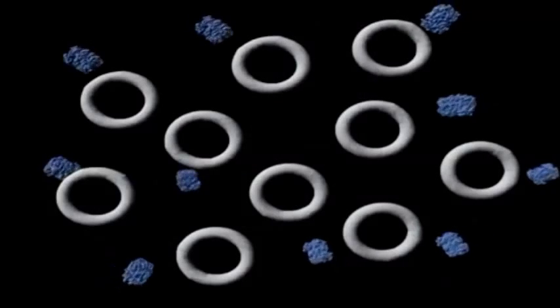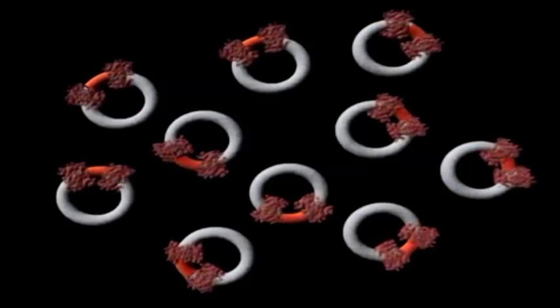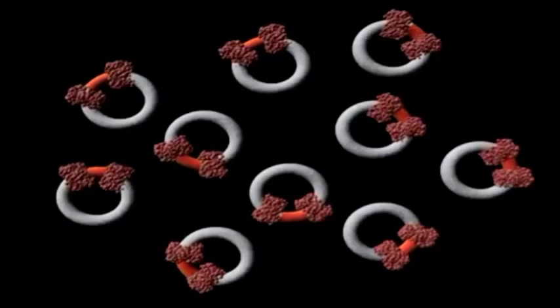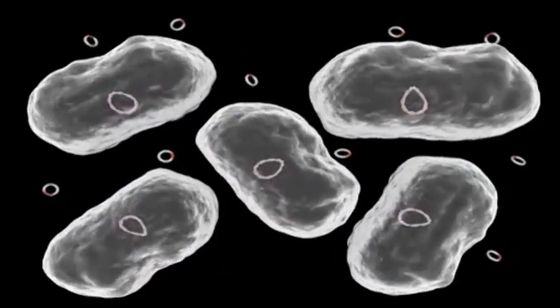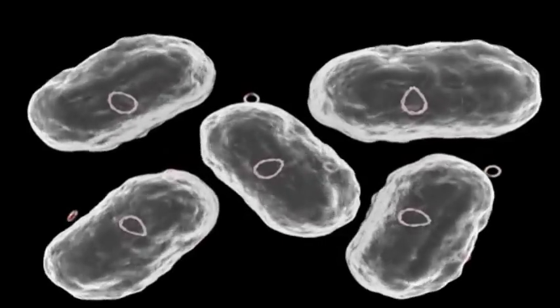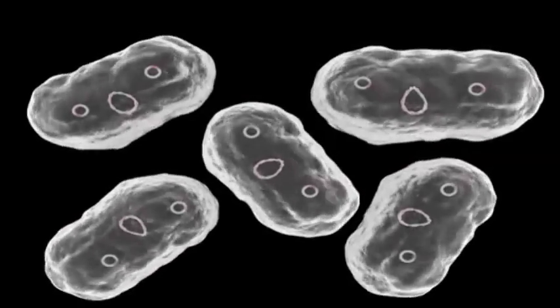Genetic engineers can place liberated plasmids in a solution with restriction enzymes and cut them apart. The engineers then place the gene segment they wish to insert into the solution with the plasmids, and then add repair enzymes that join the pieces of DNA together at their sticky ends. These new plasmids, with their newly inserted genes, are then placed with bacteria into a different solution that enables the plasmids to readily penetrate through the cell wall and membrane of bacteria.